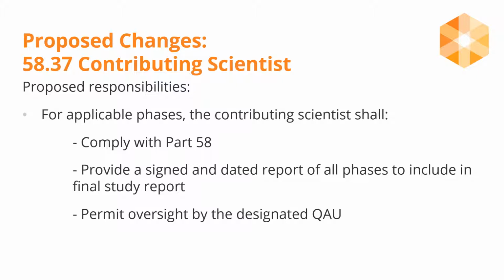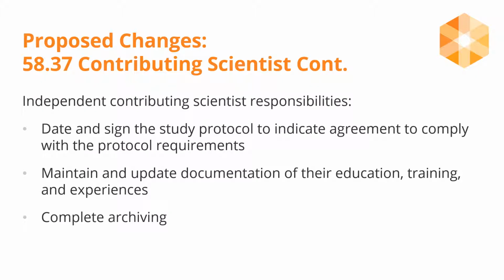Contributing scientists shall comply with Part 58, provide a signed and dated report of all phases to include in the final study report, and they will permit oversight by the designated QAU. Independent contributing scientists must complete archiving. They must provide evidence of their education, training, and experience, and they must date and sign the study protocol to indicate agreement to comply with the protocol requirements.